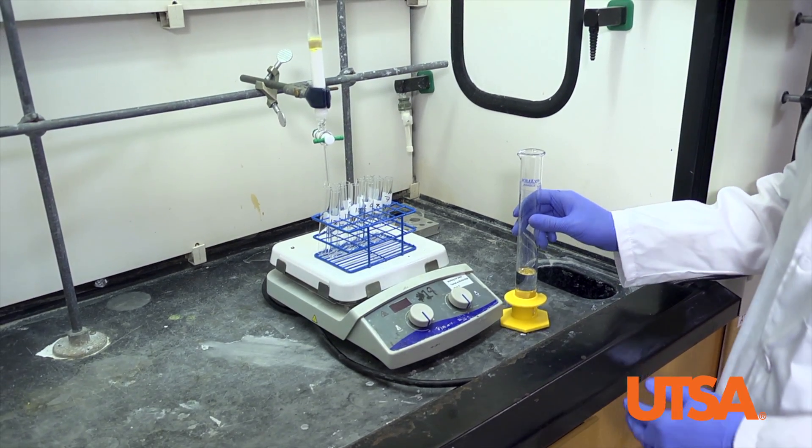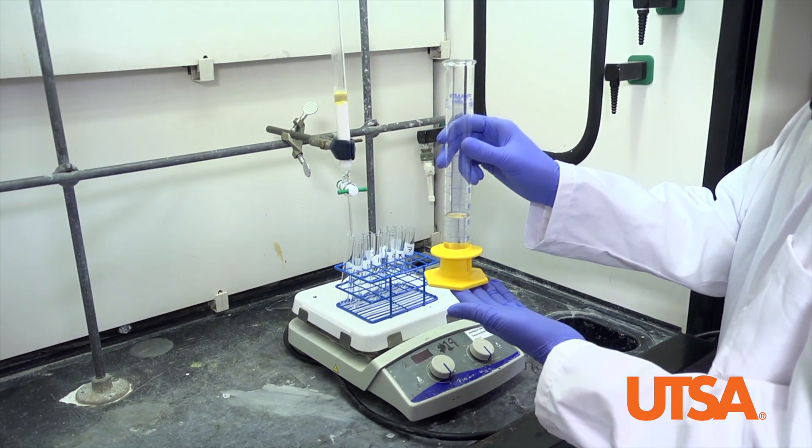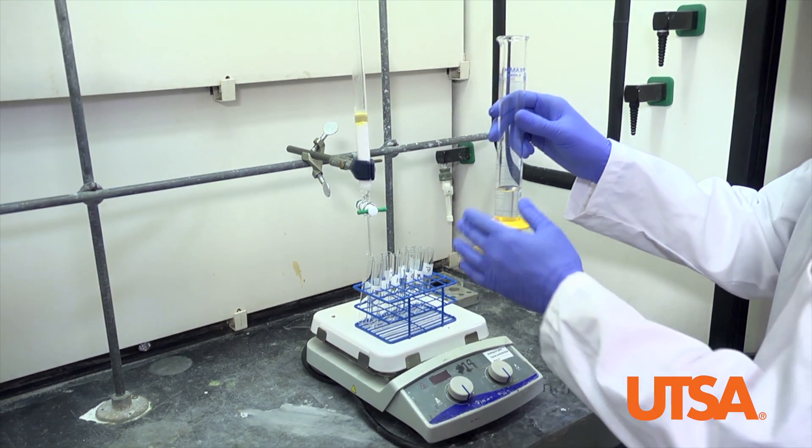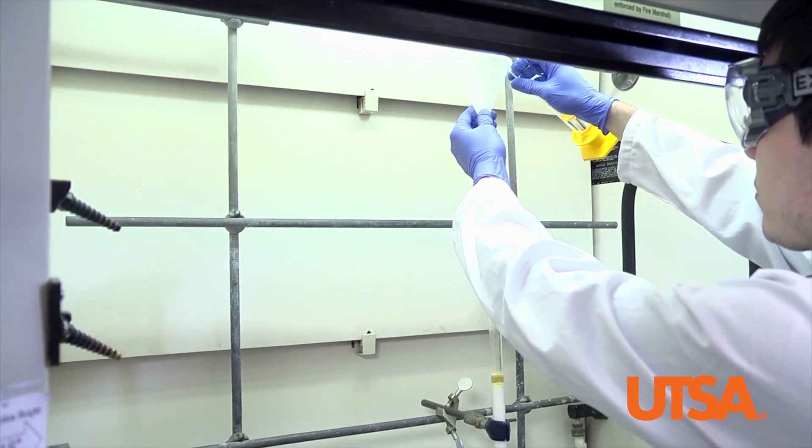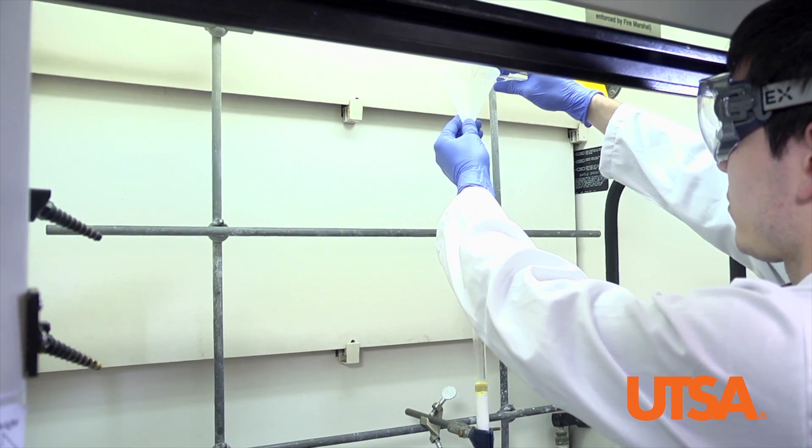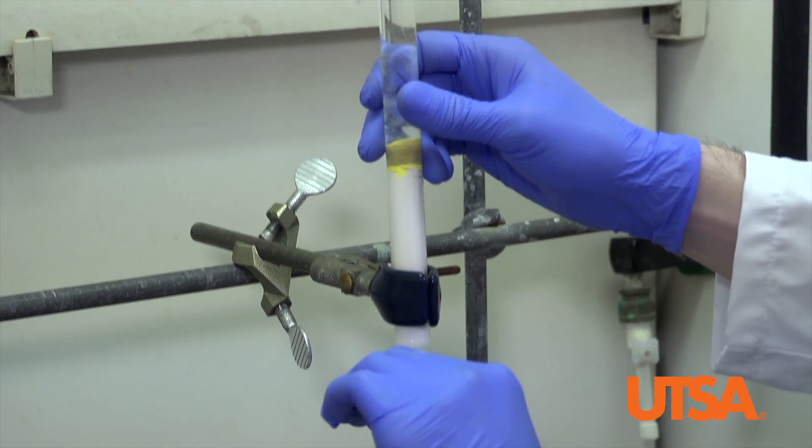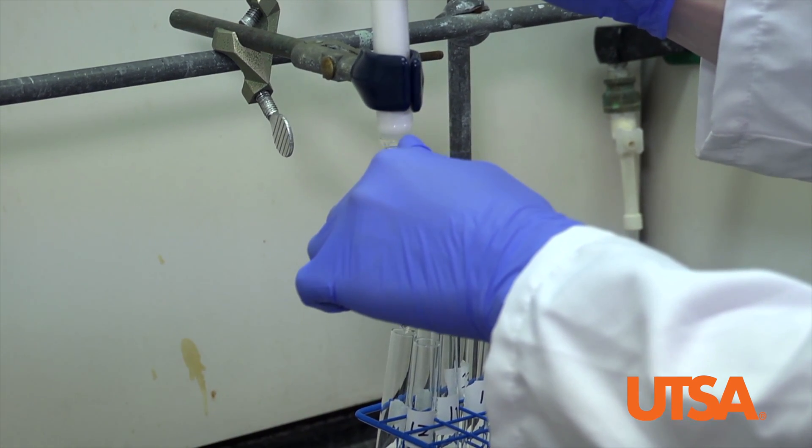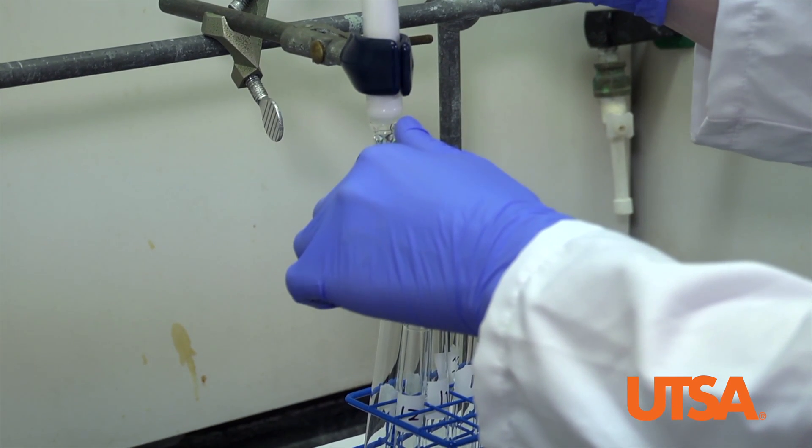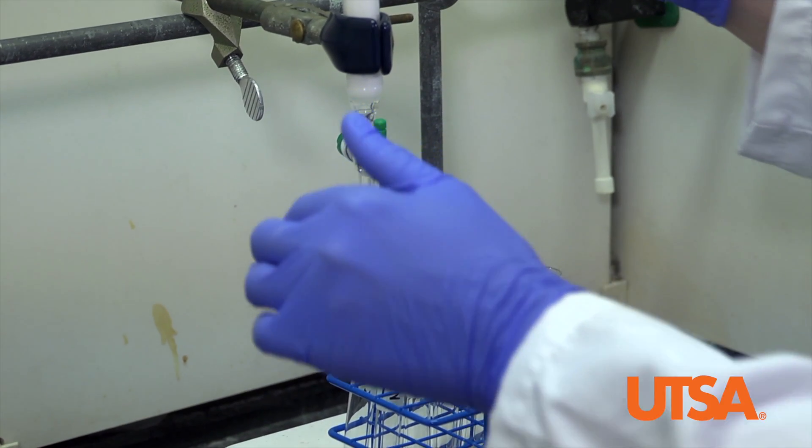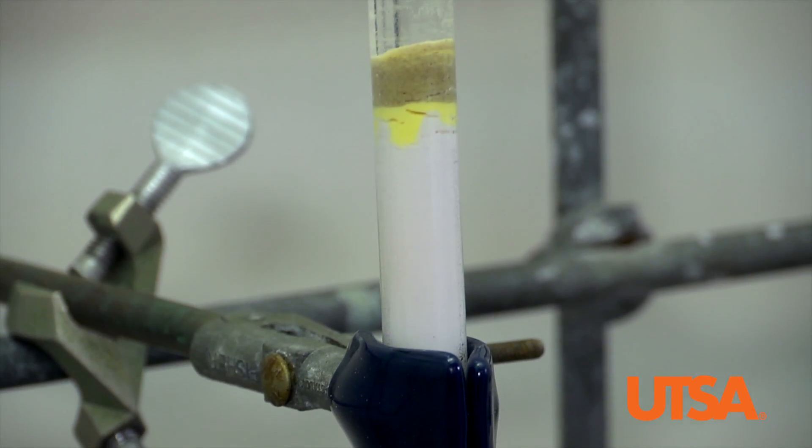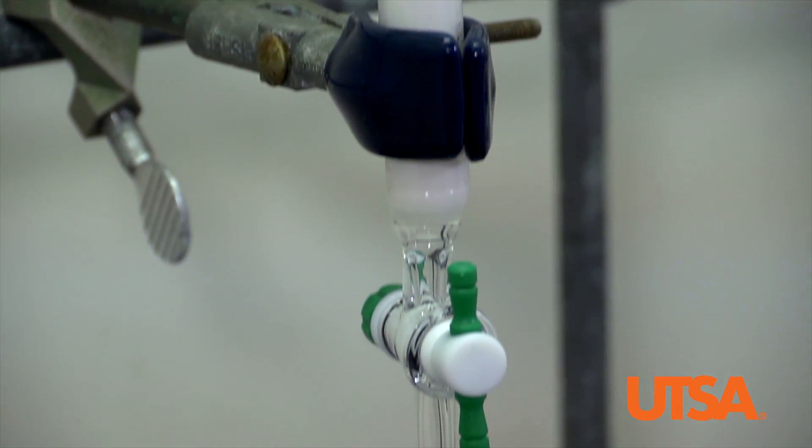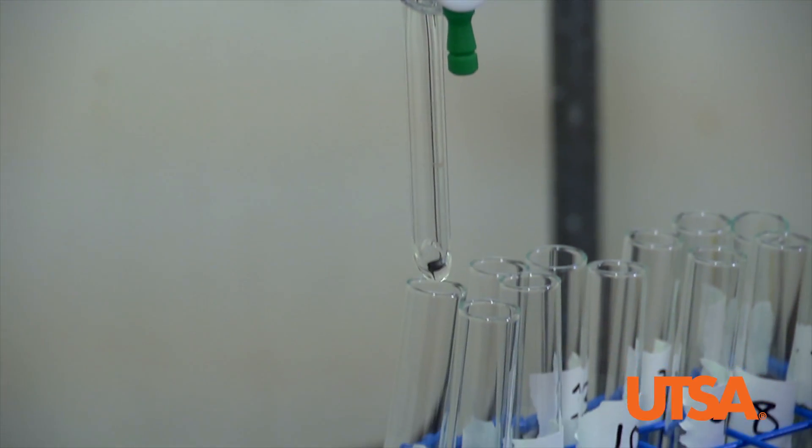Proceed by adding 35 milliliters of fresh petroleum ether to your column. Open the stopcock and collect 10 to 12 fractions of 5 milliliters each. Make sure that your tubes are labeled. 5 milliliters is approximately half of the volume of each tube.